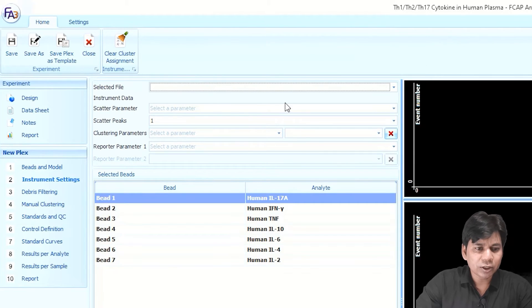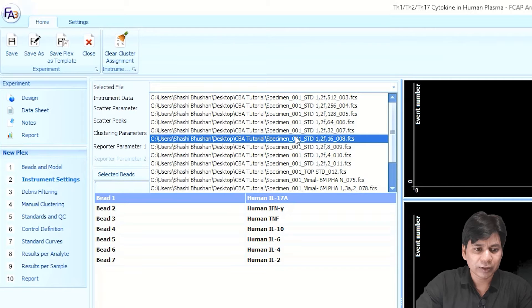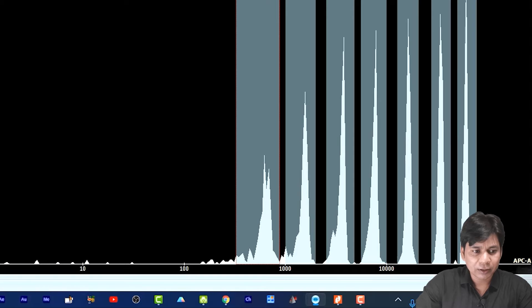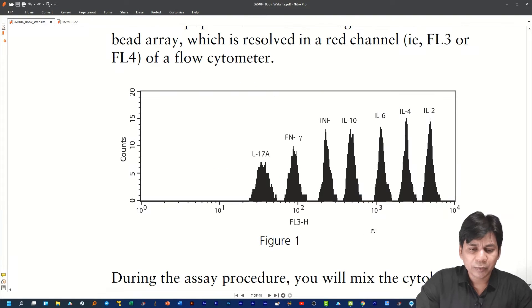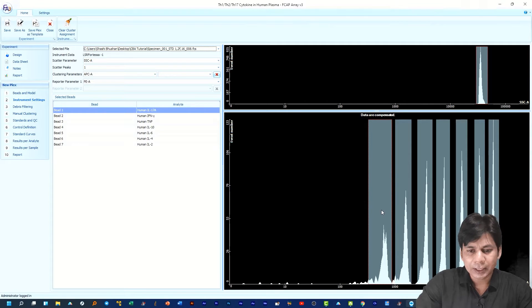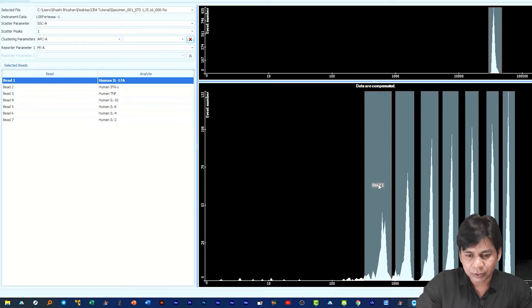After Bead Model, click on 'Instrument Settings.' In Instrument Settings you have to select an FCS file from your experiment — you can choose any file. After selecting the file, you can see the cluster of beads. In this kit there are seven beads and you can see the same seven clusters here. You have to assign each bead to its corresponding cluster. The kit manual provides information about the bead positions. In FCAP Array software you can assign the cluster by selecting the bead and dragging it onto the cluster.